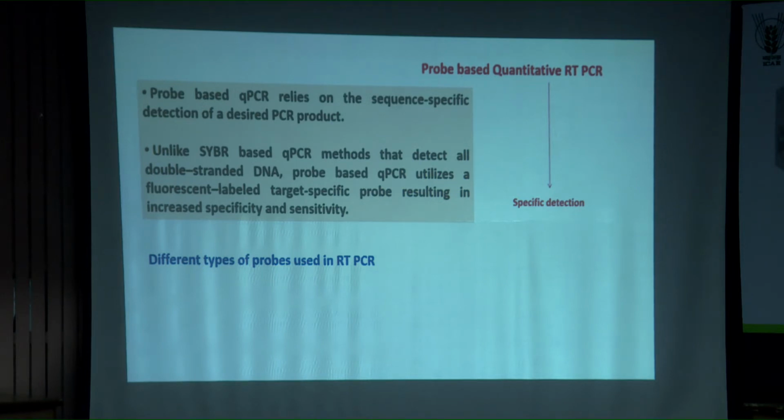At the 5' end, you are going to add the reporter, also called the fluoroprobe or fluorescing chemical. At the other end, you are going to put the quencher.